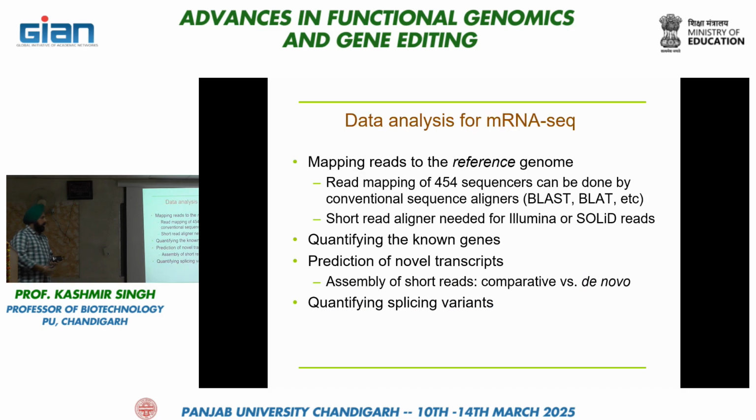Okay. So you have SOAPdenovo. Again, they do the same kind of assembly like we discussed. We have Velvet, SSAKE, Novoalign. So they do de novo assembly or reference based assembly. So what is reference based assembly and de novo assembly? Reference based assembly is that you have a reference genome and you want to assemble your reads on that.